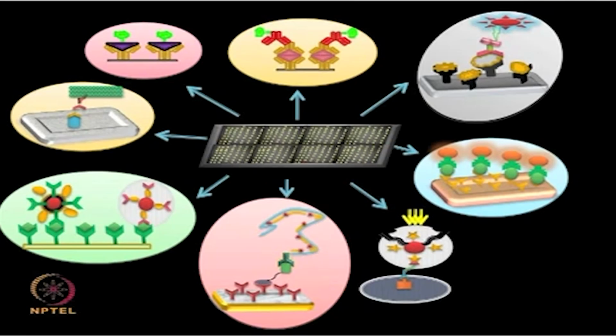So, to summarize all the various types of detection techniques which we discussed, the advancement in microarray technologies has led to the development of sensitive and reliable detection systems. The different label based detection techniques have been employed to study, in high throughput ways, thousands of proteins, as well as their interactions and function, using protein microarray platforms.